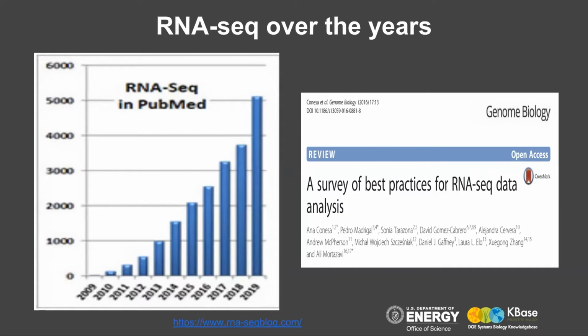So if someone is new in this field, I will strongly recommend checking this review article, a survey of best practices for RNA-Seq data analysis. It is by Conesa et al., published in Genome Biology in 2016. This is an excellent review on all of the major steps in RNA-Seq data analysis, from experimental design to functional analysis. And it also highlights the challenges associated with each step.